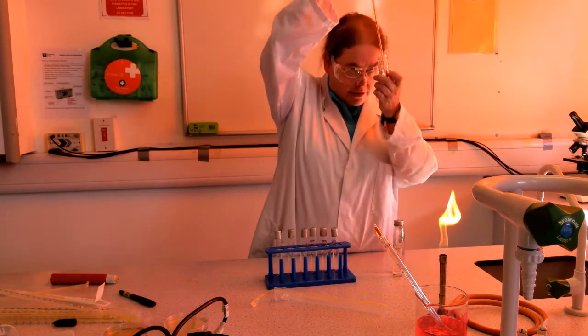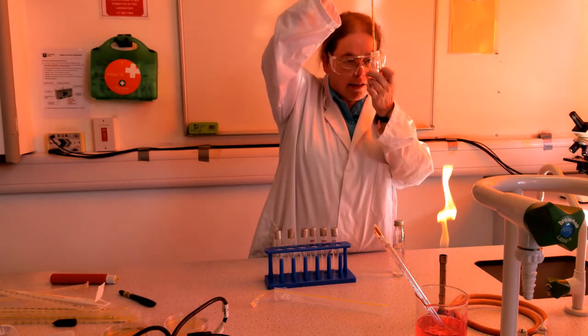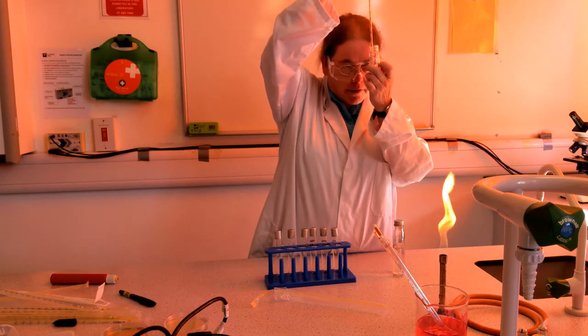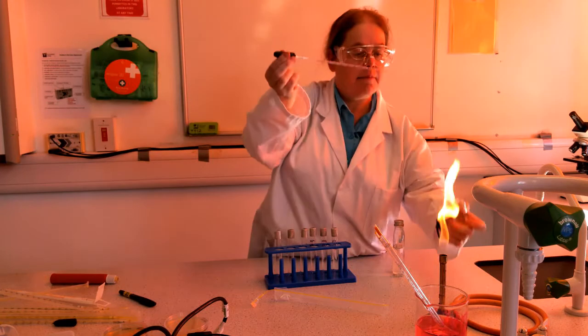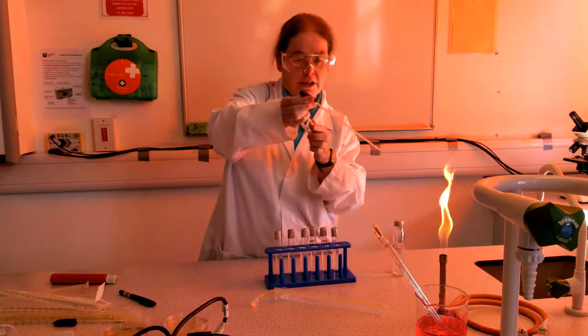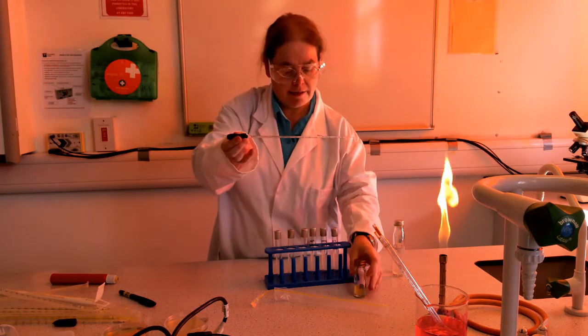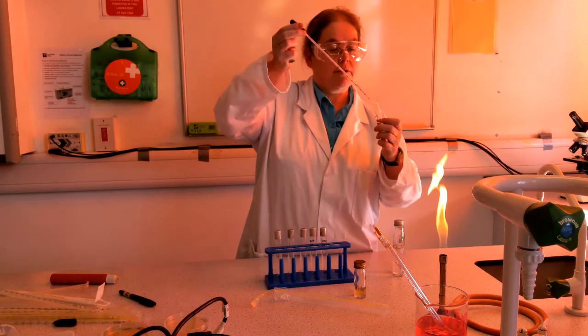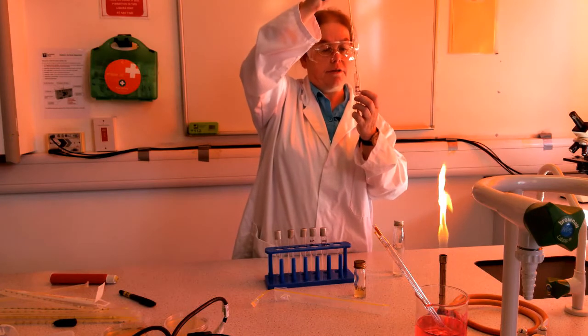We will get 0.1 mils, 0.1, yes, mils of our bacterial culture, and put them in the first of our labelled tubes.